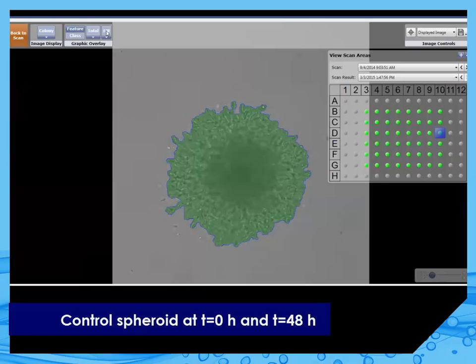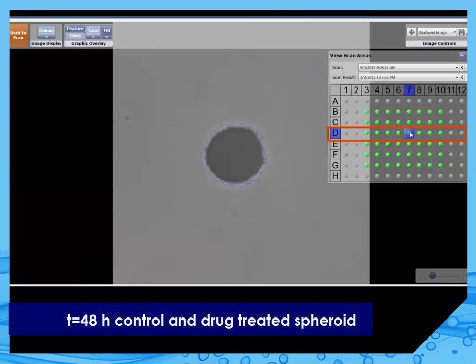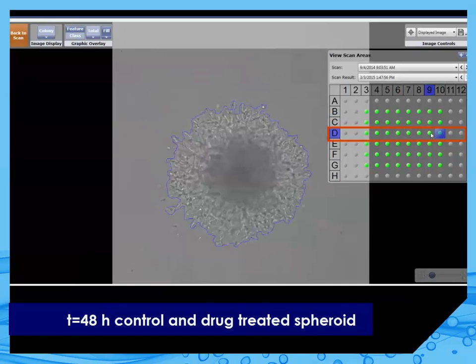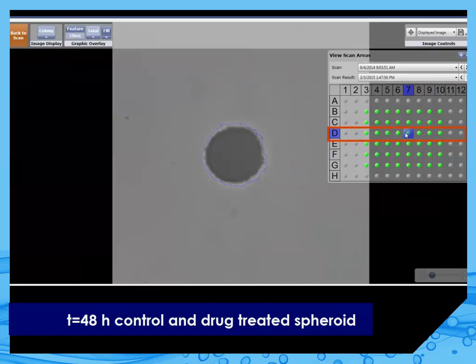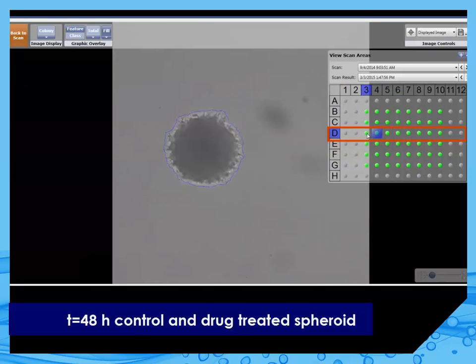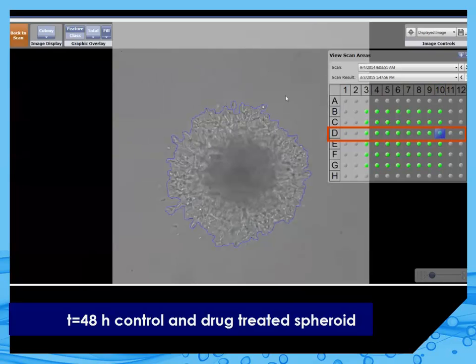In other wells on this plate, the spheroids were treated with different concentrations of 17-AAG. We can navigate between any well on the plate to quickly examine the differences between the experimental conditions. In this well, we see that the invasion into matrigel is inhibited by 2.5 micromolar drug treatment. We can go across the drug treatment concentrations to look at different wells at different conditions and get a quick global view and understanding of the conducted experiment, then compare it to the control.